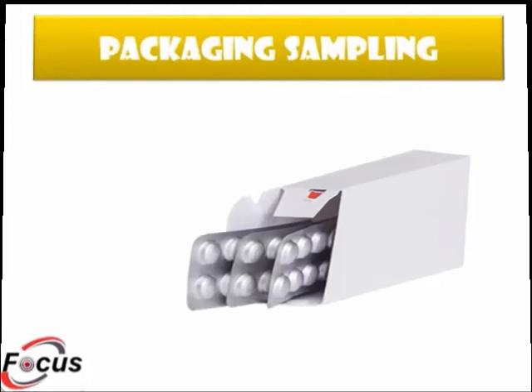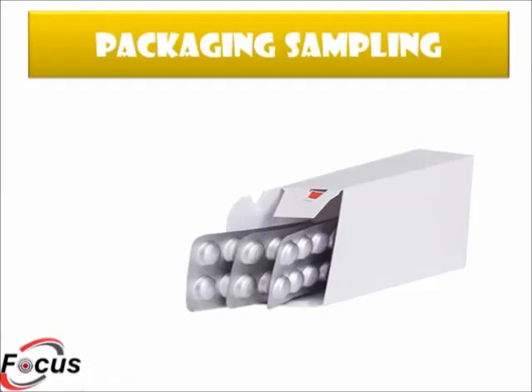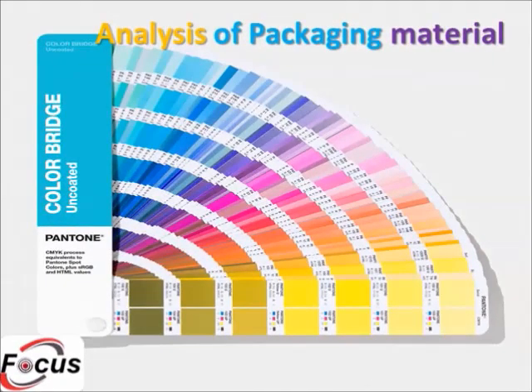Samples of packaging material are delivered to quality control to be analyzed before contacting the product. Quality control analyzes the color and the material of the packaging according to its specification from pharmacopoeia or supplier specification.